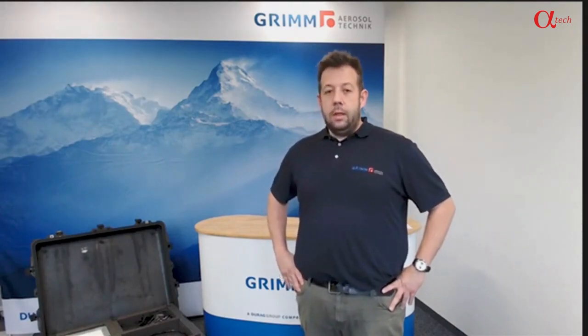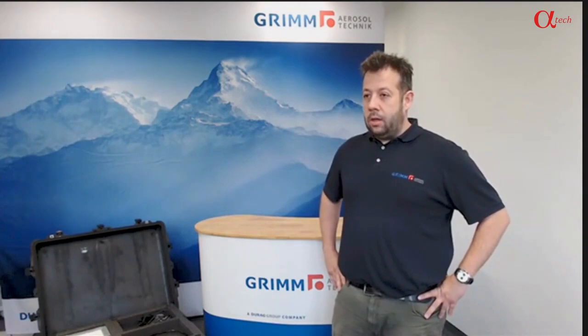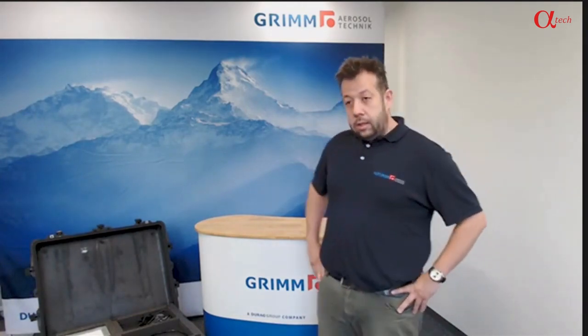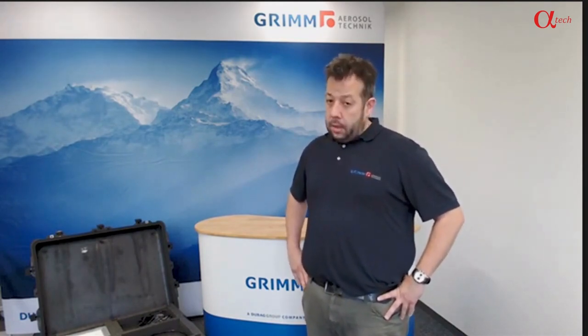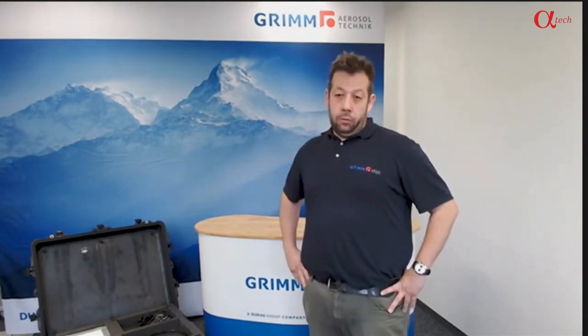Welcome to this product demonstration. My name is Gerhard Steiner, together with my colleague Frank Tettig, who is still here in the off. Good morning. We are going to present you the setup of a Grimm SMPS Plus C system, show you the unboxing, show you the individual components, describe them, and then also give you a tour through the software and the possibilities we have using the Grimm Nano software.